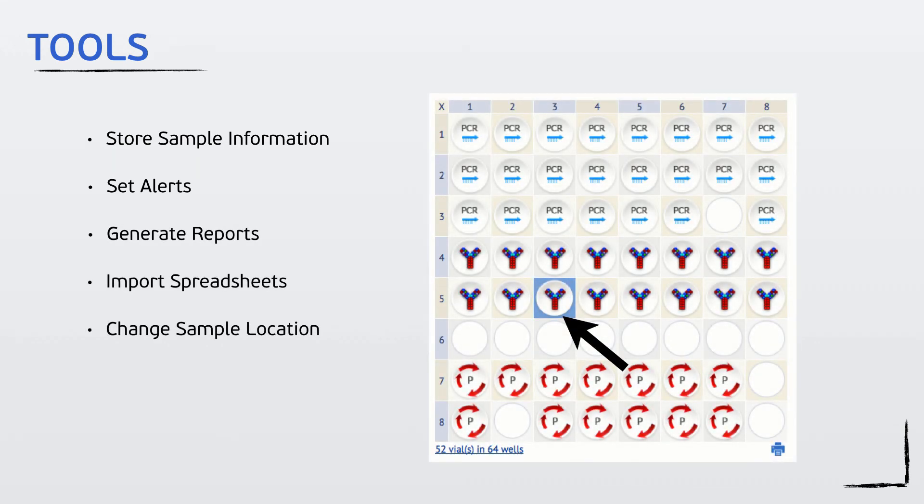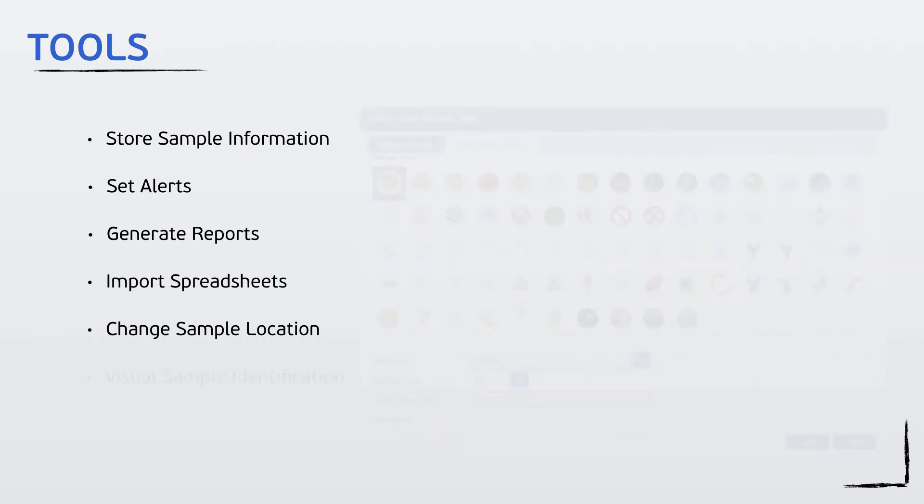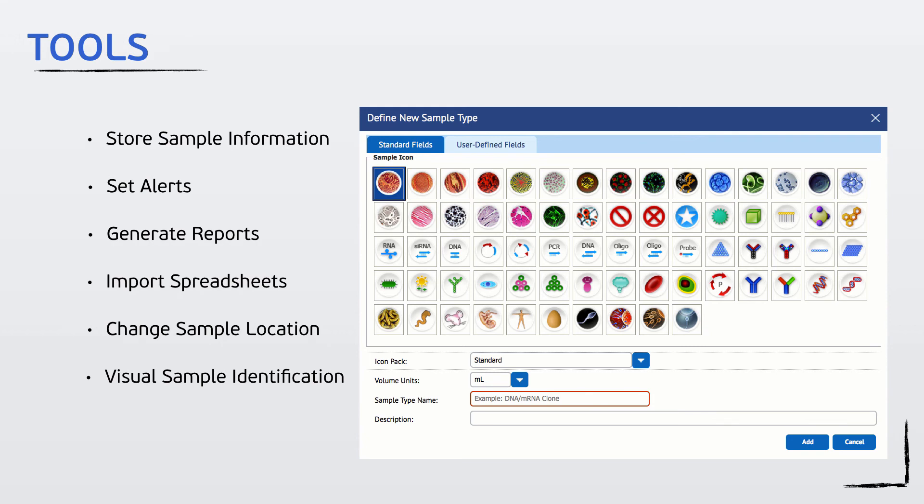Change sample or box location by a simple drag and drop, and create visual sample identification. All of these tools and more are easy to use with just a few clicks.